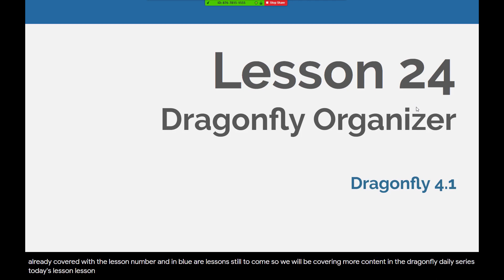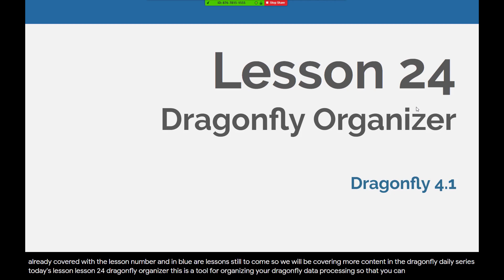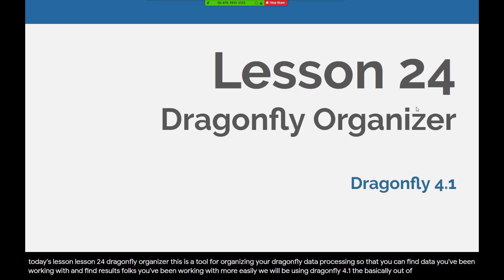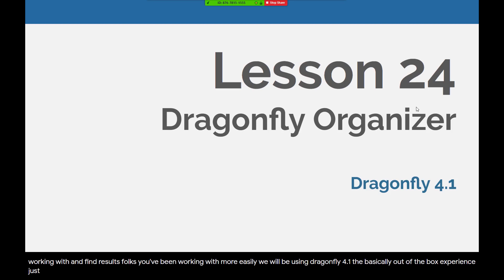Today's lesson, Lesson 24, Dragonfly Organizer. This is a tool for organizing your Dragonfly data processing so that you can find data you've been working with and find results you've been working with more easily. We will be using Dragonfly 4.1, the basically out-of-the-box experience, just maybe a few customizations that I made in customizing Dragonfly Lesson 6.